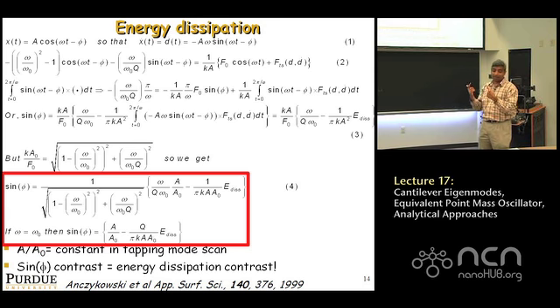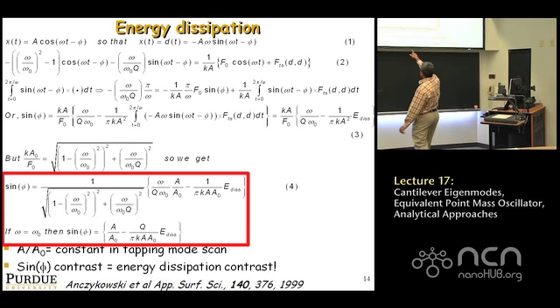So when you scan over a sample, A over A0 is kept constant, because you're using feedback to keep A over A0 constant. If your feedback is correctly set, and the error maps are very nice and flat, with very little error due to feedback, then as you scan over a sample, regardless of the local material properties, A over A0 must be constant, so long as your feedback control is operating correctly.